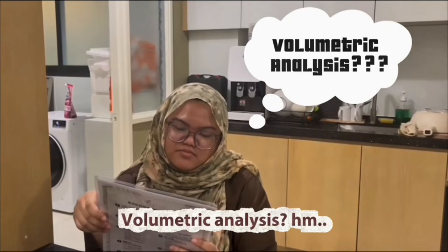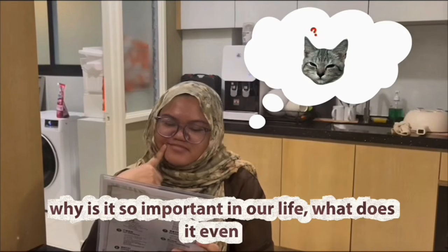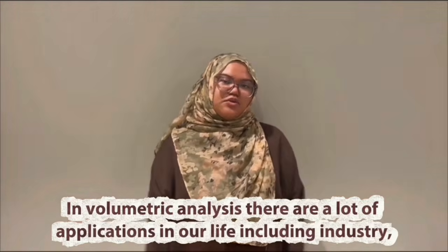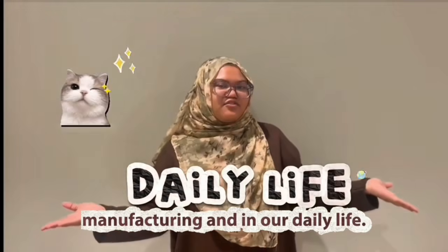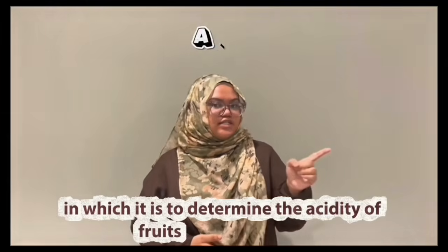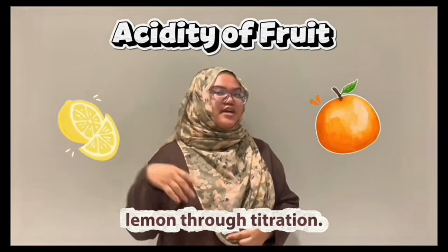Volumetric analysis? Why is it so important in our life? What does it even do? In volumetric analysis, there are a lot of applications in our life, including industry, manufacturing, and in our daily life. In today's video, we will talk about one of the common applications of volumetric analysis, which is in our daily life, in which it is to determine the acidity of fruits such as orange, lemon, through titration.